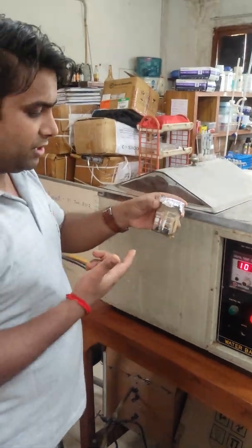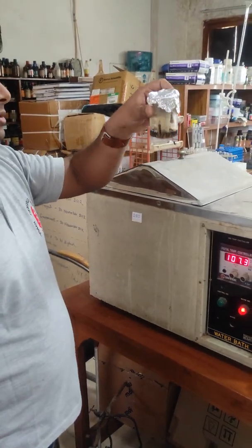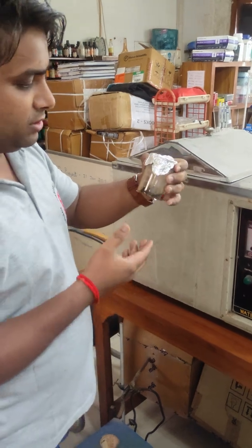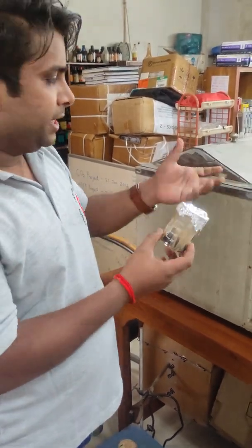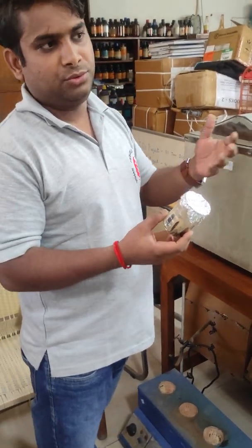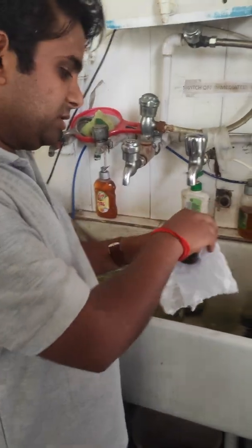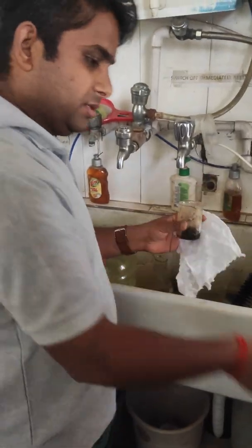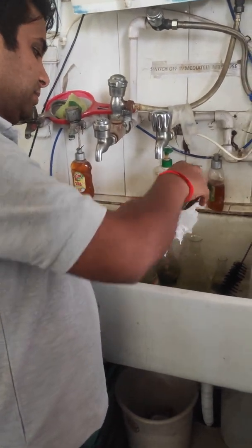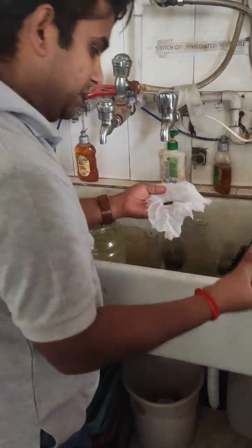After one and a half hours we get the material like this. Now we will wash the material in tap water. Generally we wash the material 2 to 3 times. We are going to wash the material with the help of a muslin cloth. Just open and pour the material onto the muslin cloth. Now I am going to wash the material.